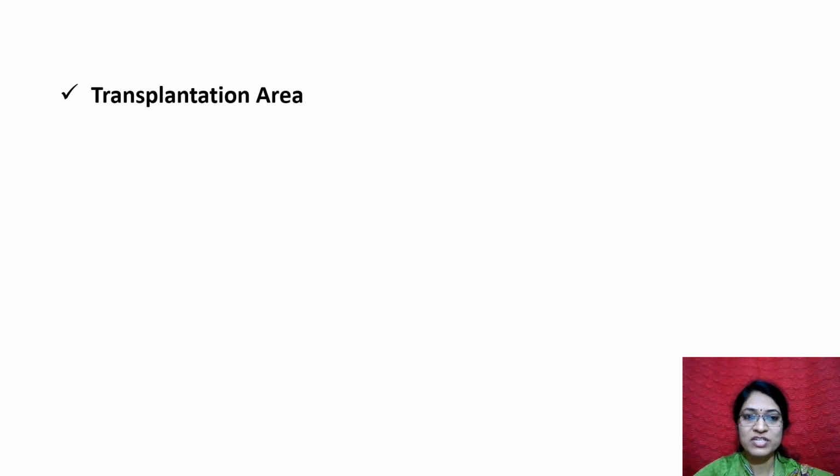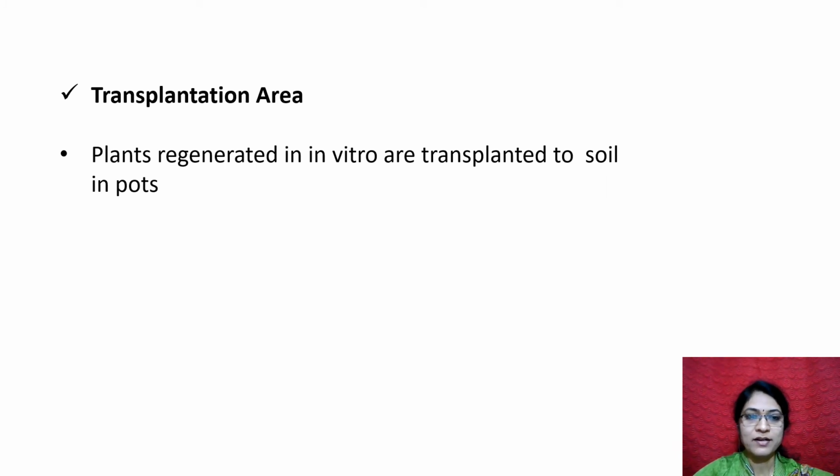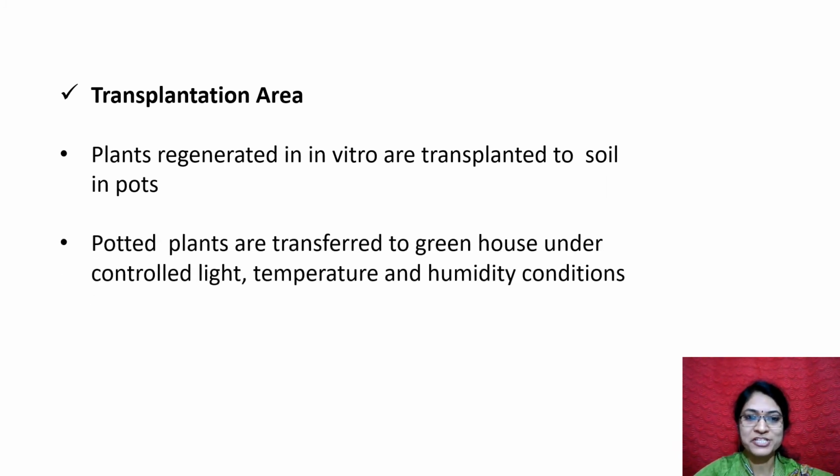This is the most important facility which must be there in the laboratory, that is the transplantation area. Here the acclimatization of tissues or plantlets will be done. Acclimatization, which I have already explained in the previous session, is the hardening of the plantlets. After plantlet growth, the plantlets which are grown in laboratory condition are very sensitive.